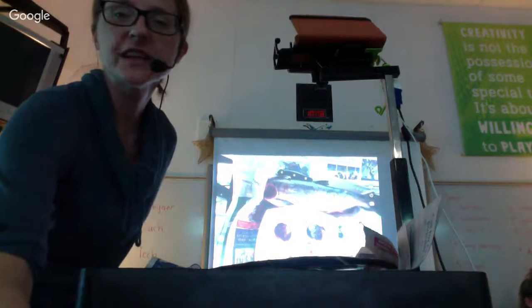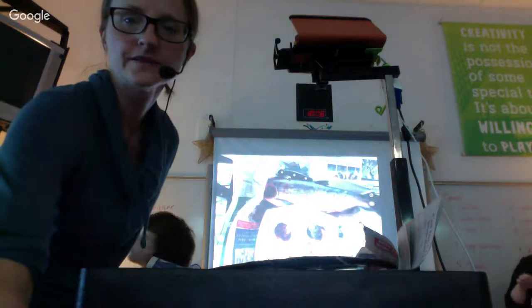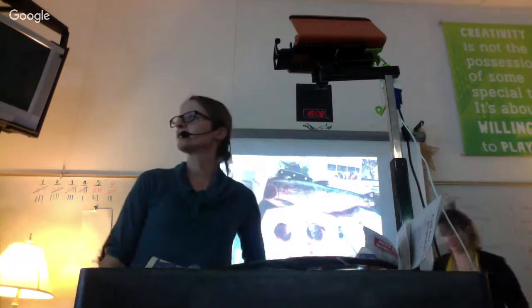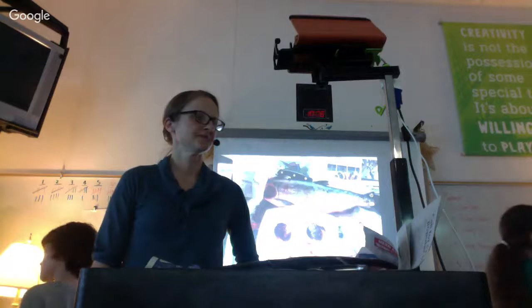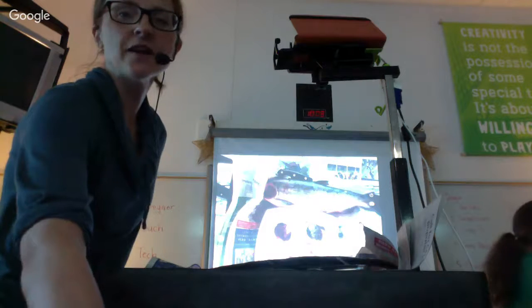Now, I can't remember if the next question was about a male or a female, but eggs, milt. I'm pretty sure it was. So, I just got water on me. We're going to see. So, tech person, before we leave, we are going to go to the next question. Oh, we got the gills. Gills question. Okay. How many arches does each gill have? Good job.